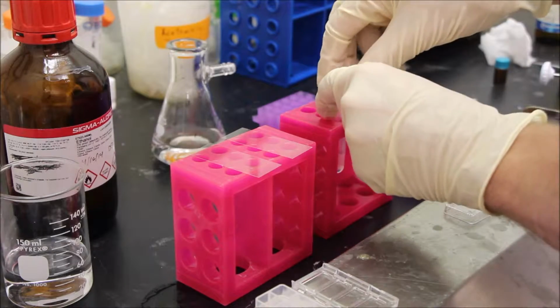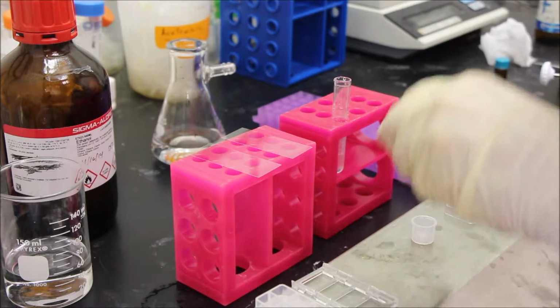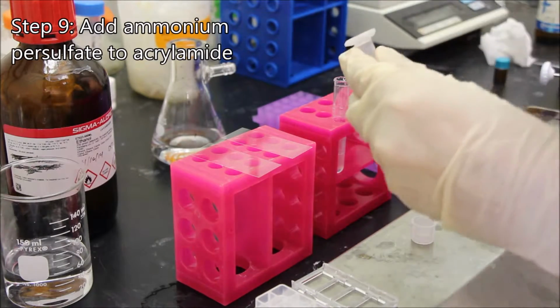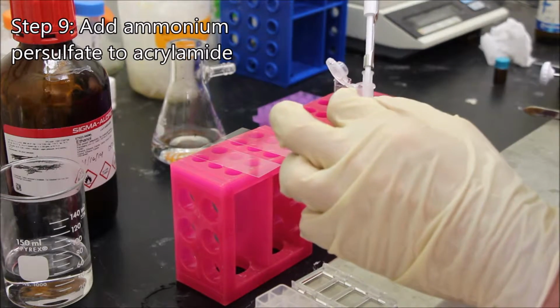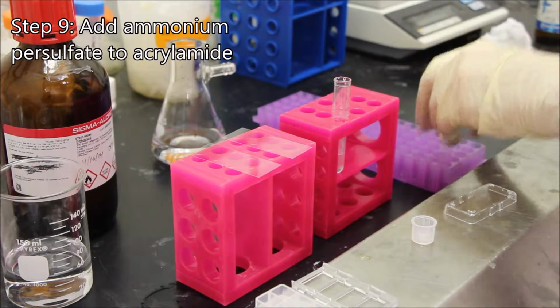So now our solution's ready to go. So what we're going to do here is take our 10% weight by volume ammonium persulfate, take 5 microliters. I gotta be quick for this portion.